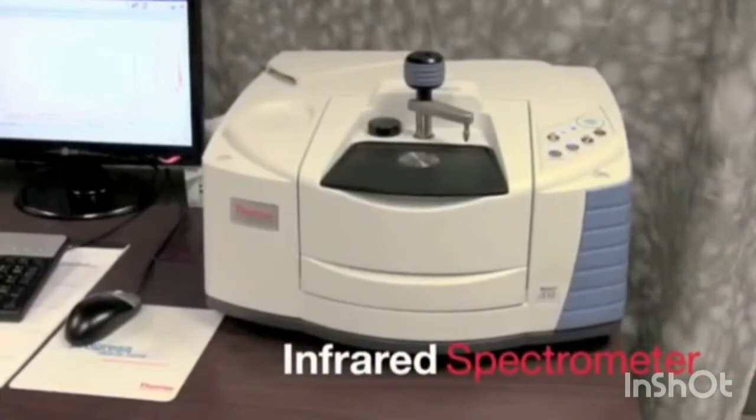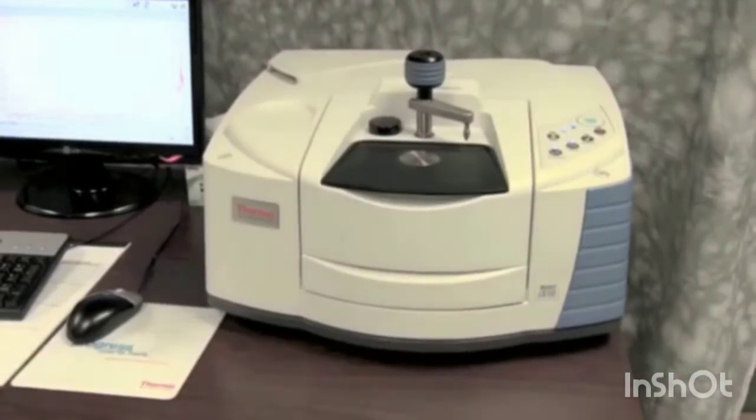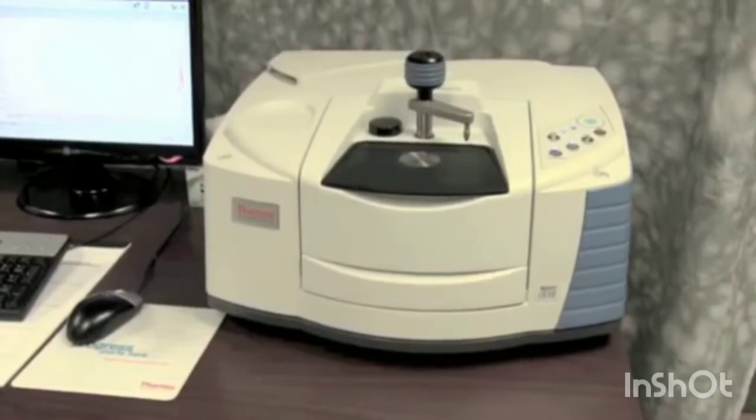This is the infrared spectrometer. It has an infrared light source that is the baseline of the energy. And what happens is a sample is put into that light source and then the absorbance of that sample is what is used to measure the bonds of the carbon atoms.